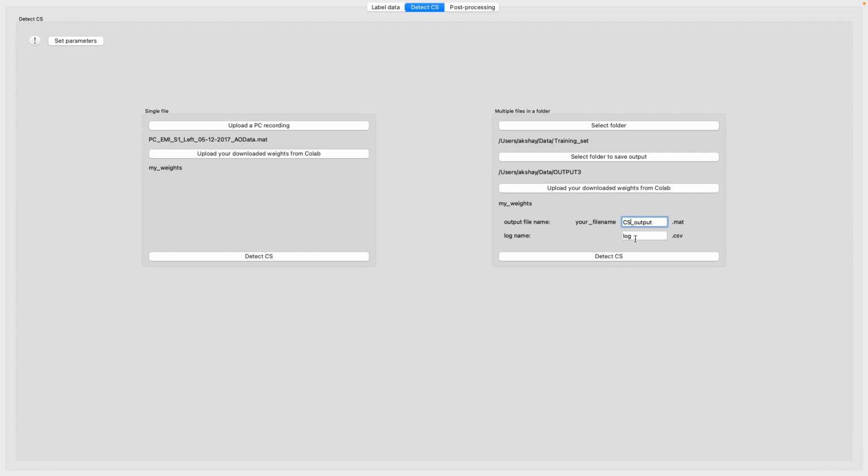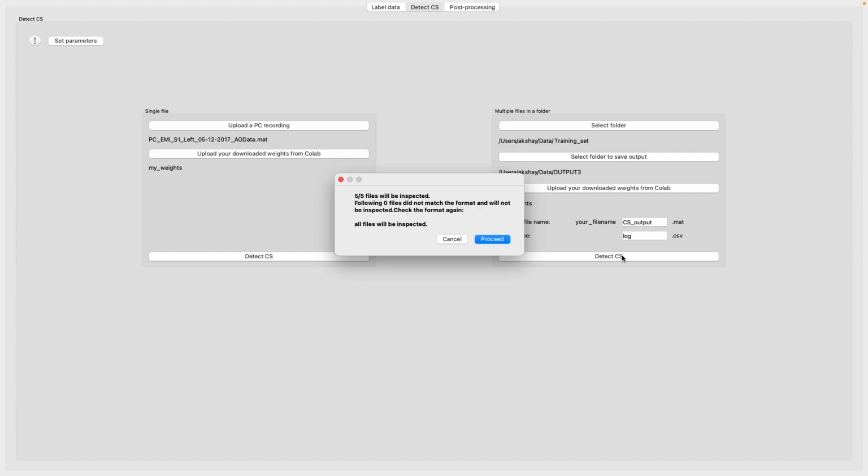And this is just some other file that will be generated by default along with this output file that will contain your complex spike labels, your embedded IDs from the UMAP, and your start and end times of the complex spikes, which will allow you to calculate the duration of the complex spike as well.